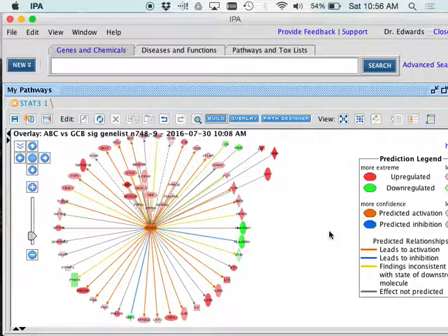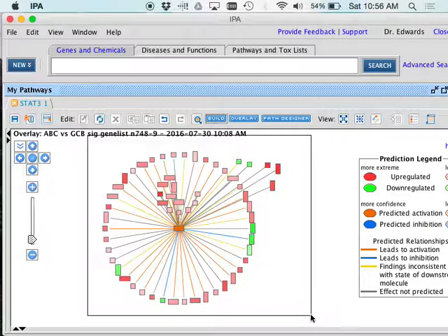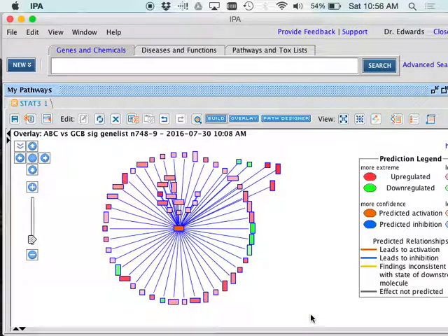Now here's what I'm going to do. I'm going to put some kinetics on this. Here's what I want you to do: I want you to select all of this. Let's draw a big box around everything. I've got everything radiating out of STAT3, and that's great and all, but that's not how things work, right? It's not a bunch of pipelines, it's more spider webs. Now I'm going to figure out the spider webs here. So I've selected everything, hit build.